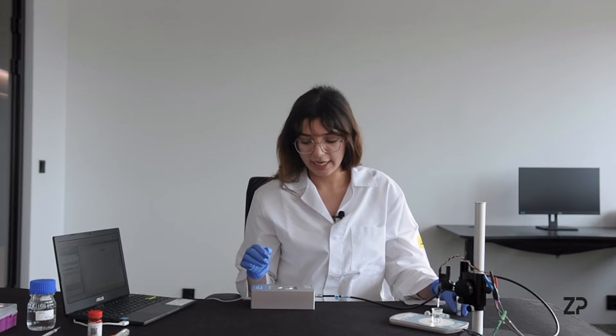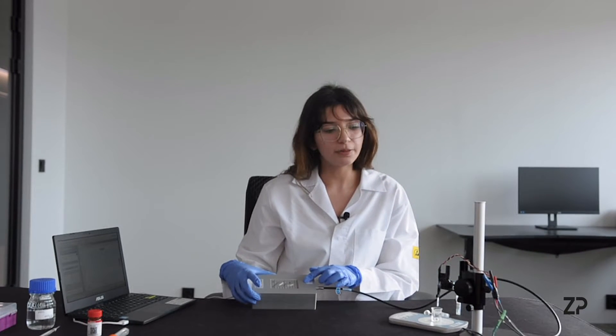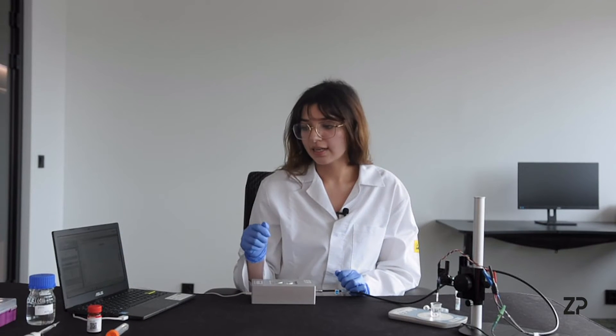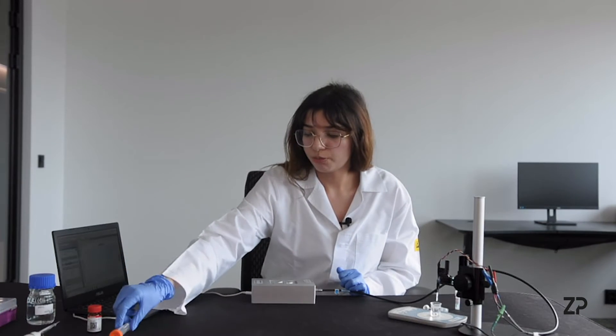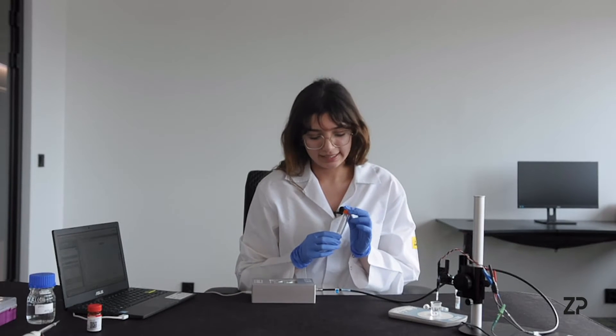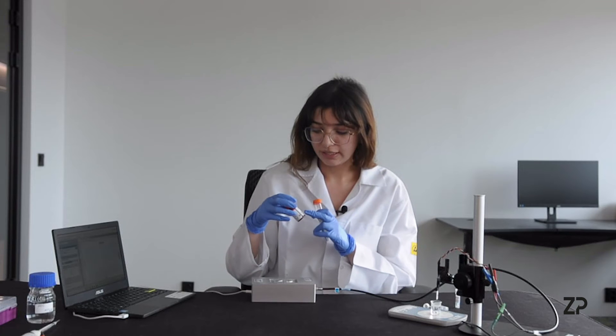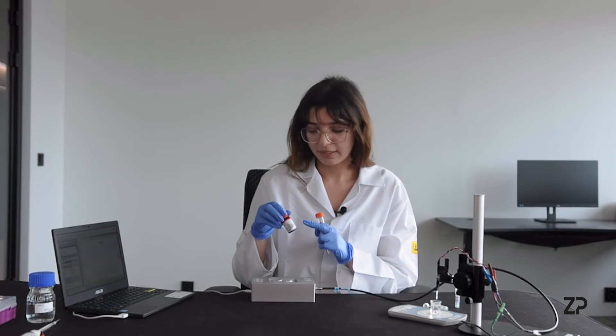You also need a potentiostat — today we're using the ZP Anapot. You'll need five milliliters of PBS and 0.5 molars of lactic acid in PBS. We're using L-lactic acid from Sigma.